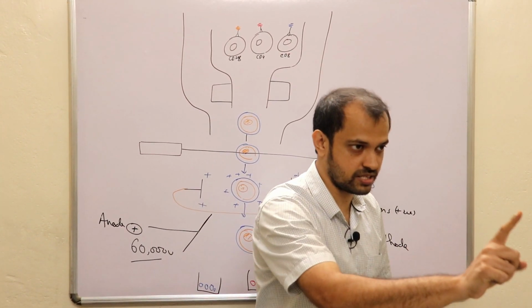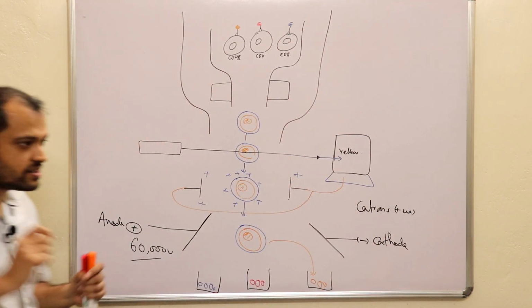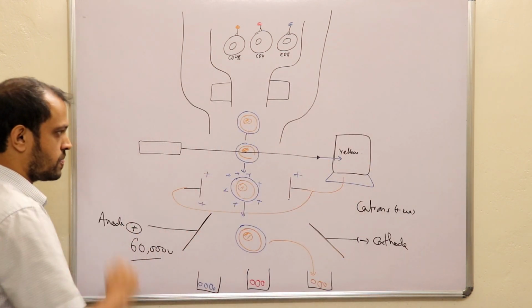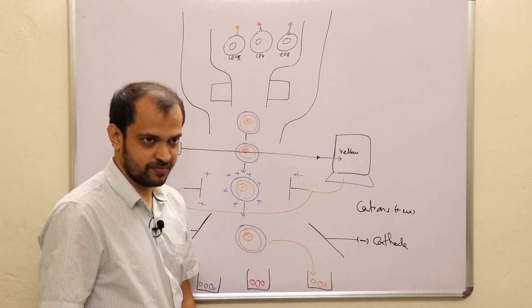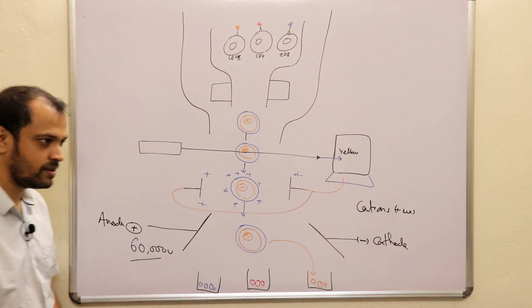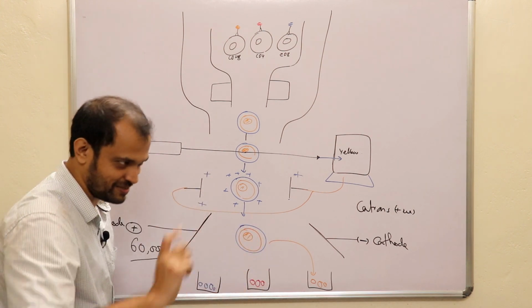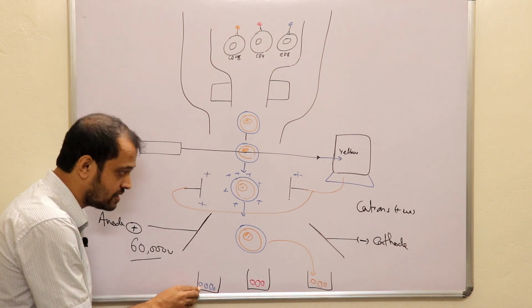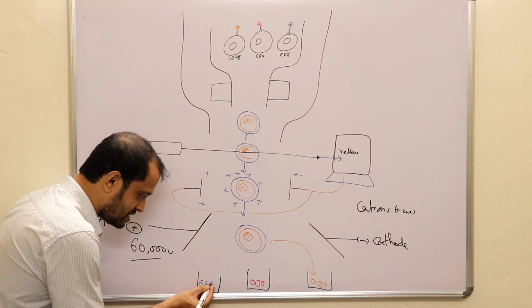Now listen with all your attention. A very important and interesting point to understand. I am giving you an example. Just apply your brain, nothing else. This is the population of CD8 positive cells, right? They are all negatively charged.